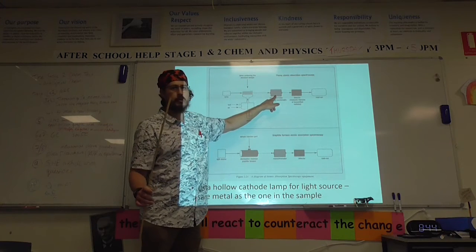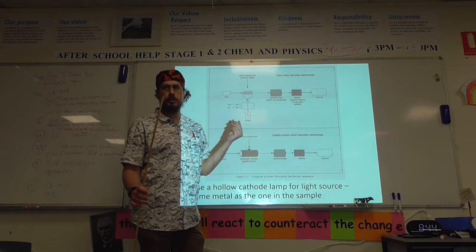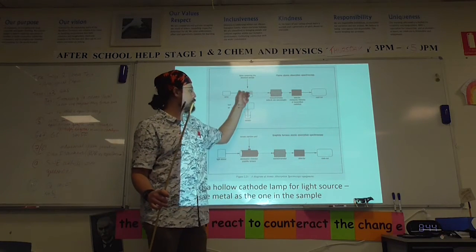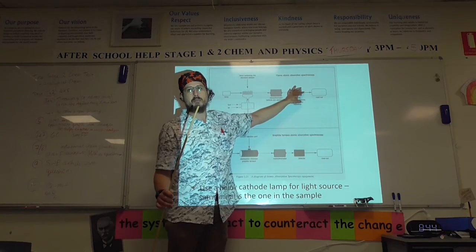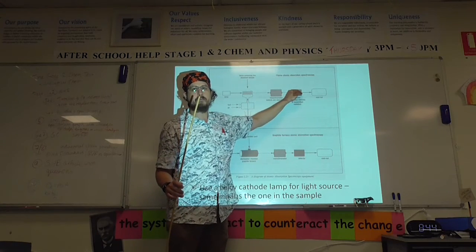Now, through the monochromator, what that means is it's going to just look at one of the wavelengths, monochroma, one colour, and then you've got this detector. Now, when you put water through, it'll have all of the light go through and none of it's absorbed. And it's in a straight line. It's like a tight beam.